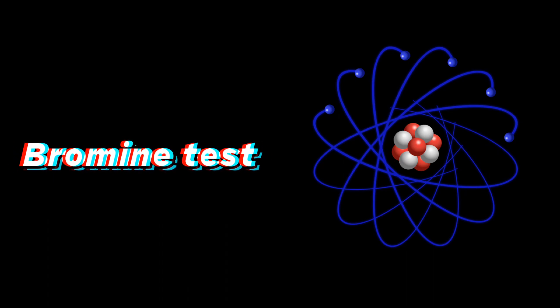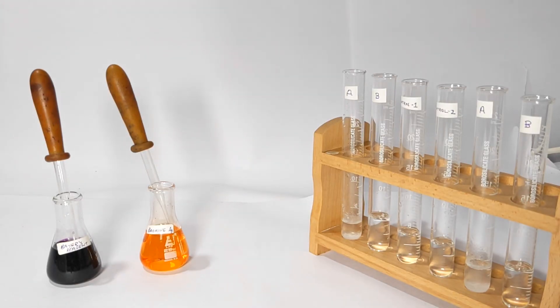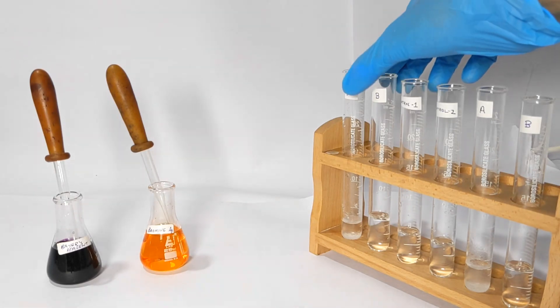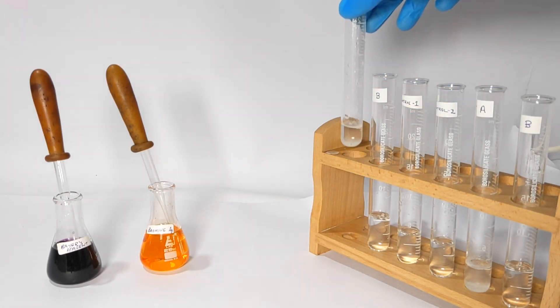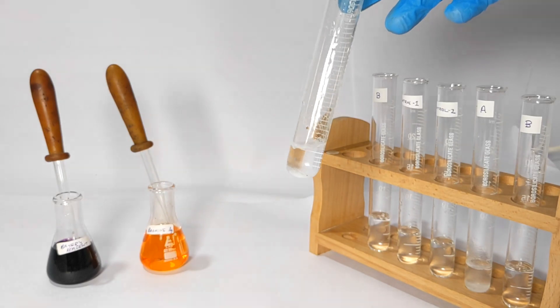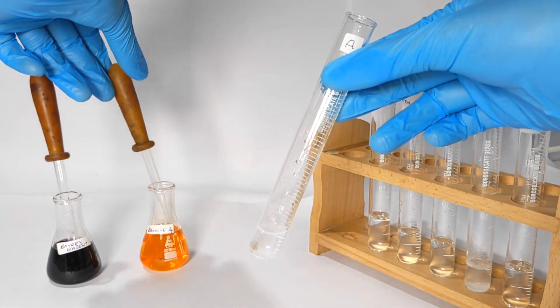We have test tubes marked A and B each containing a different organic compound dissolved in water. The third test tube is a control solution which contains pure water. We will first take the test tube marked A. The reagent that we are using is aqueous bromine, that is bromine vapors dissolved in water.